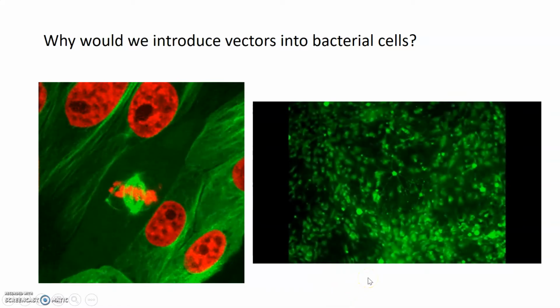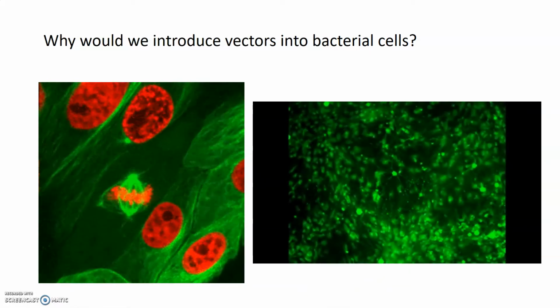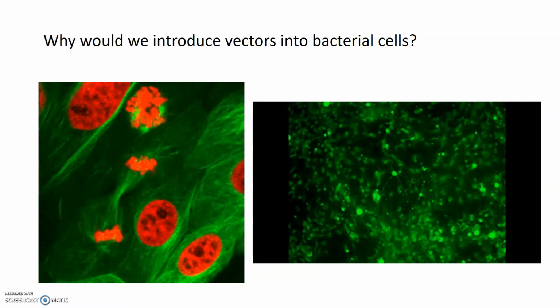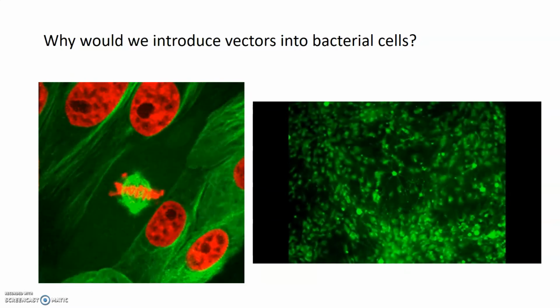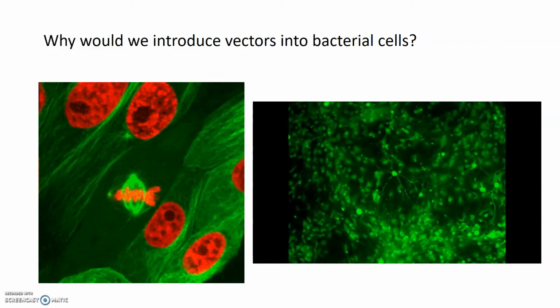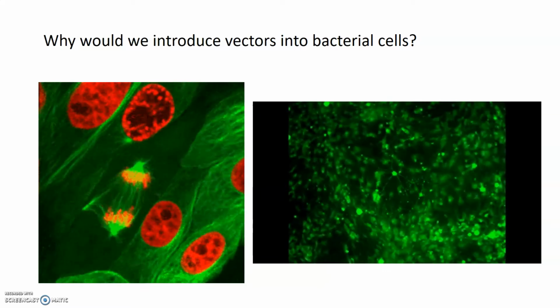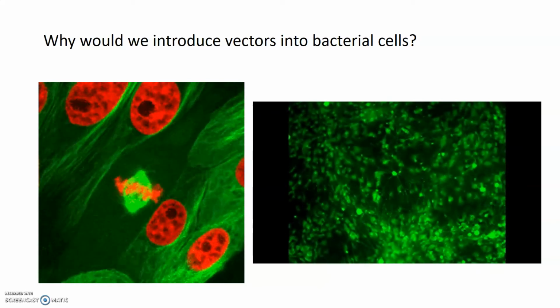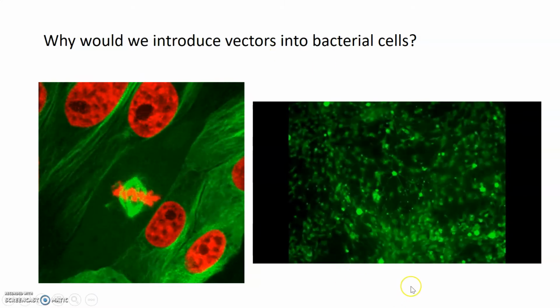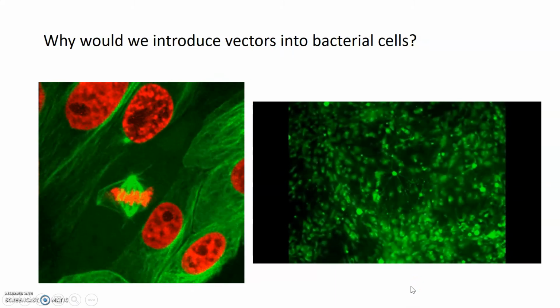And all of this is kind of amazing. Sometimes I think at this point in science, we've seen a lot of fluorescent images, and we've seen GFP being used for a lot of different things. And so it's important to go back and remember how we generate all of these constructs and how important understanding bacteria, as well as transformation and plasmids, really is to understanding how we generate all of these different really cool tools that we now kind of use in almost everyday life.